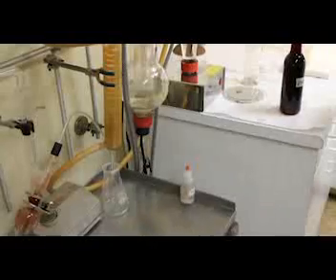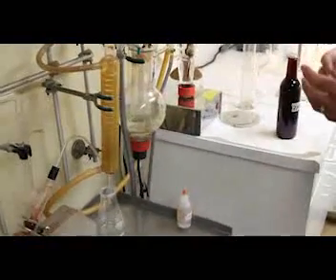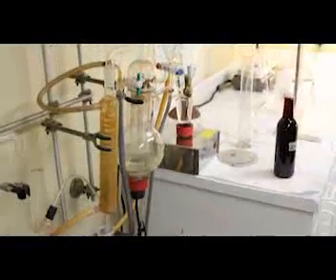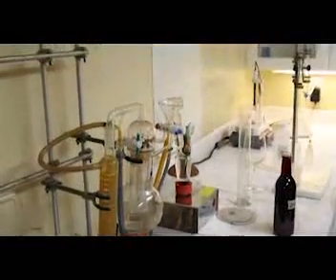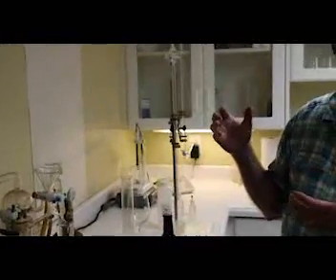And by knowing the amount of the sample of wine and the molarity of the base that we're going to use, which is sodium hydroxide 0.1 normal, we can calculate the amount of vinegar that's in the sample.